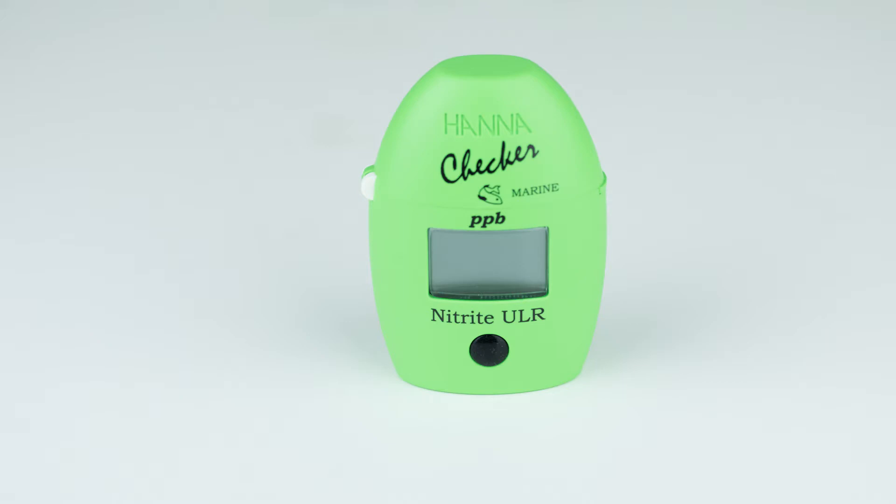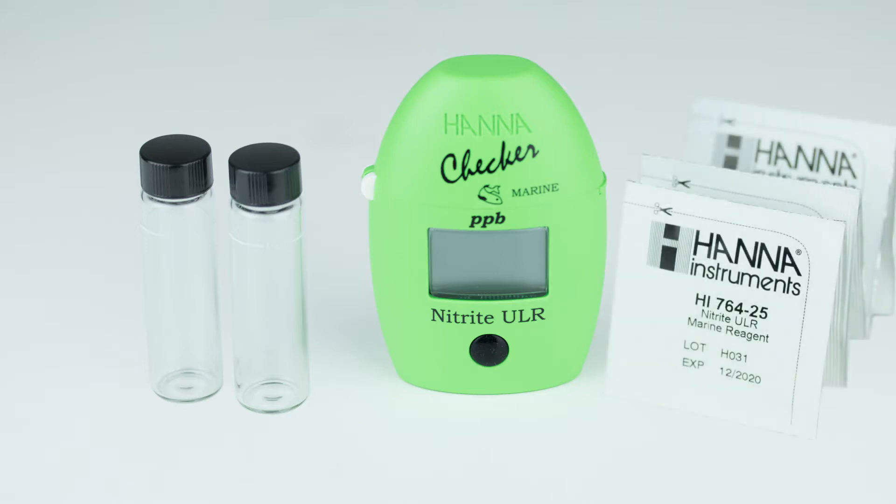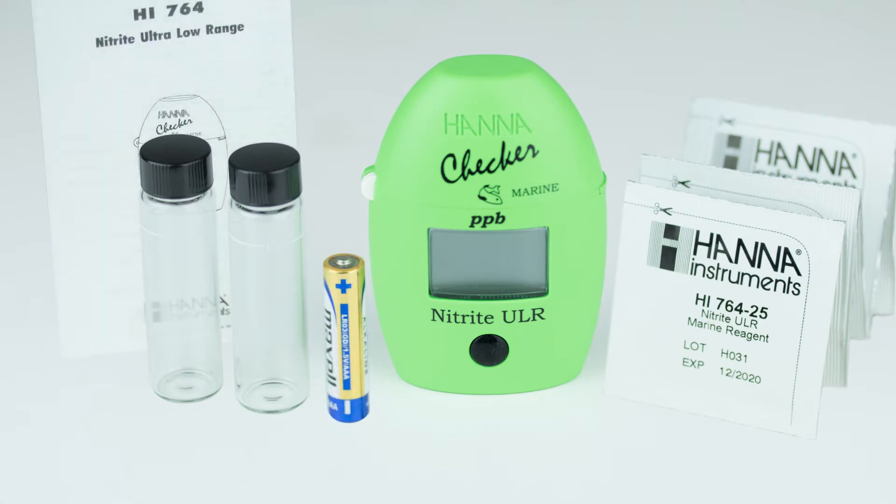The HI-764 kit comes with everything you need to begin testing: two sample cuvettes with caps, Nitrite Ultra Low Range Reagent Starter Kit, AAA battery, and the instruction manual with quick start guide.